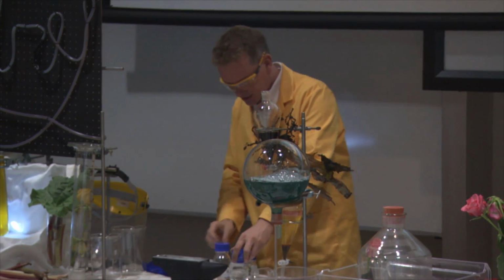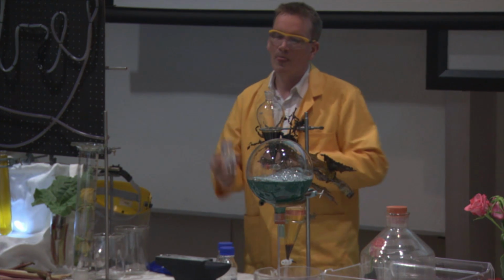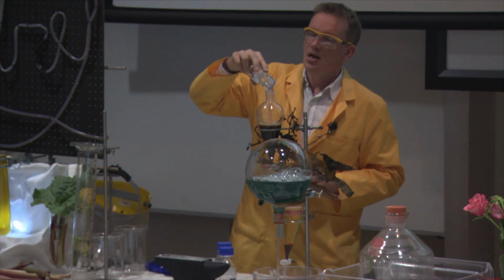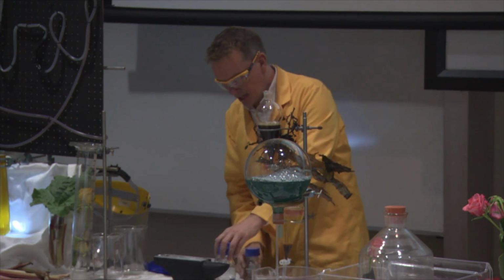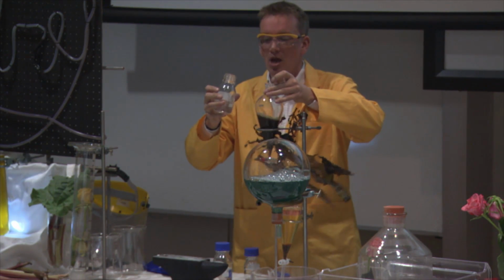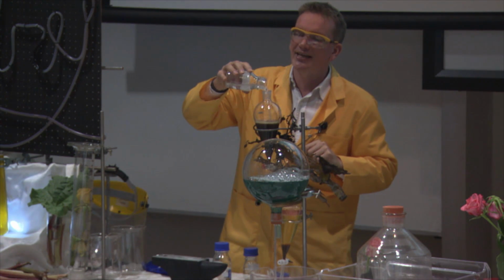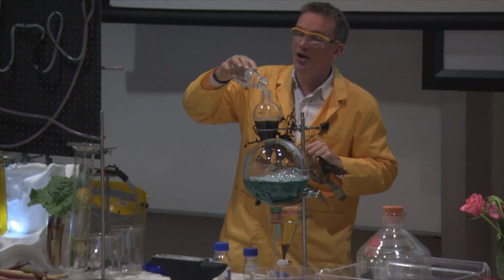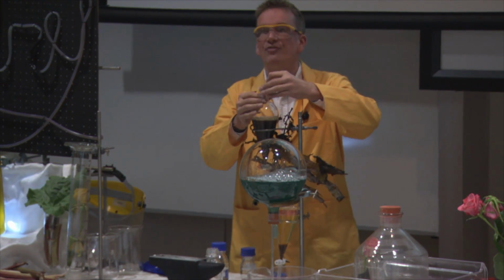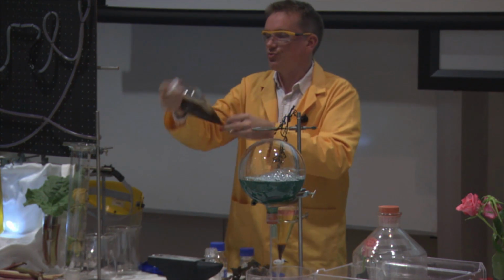I'm going to add some acid to this. Okay, so add some acid. Now I'm going to add something else, some hydrogen peroxide. Now this is used to convert any of what I'm looking for, which is, I'm trying to find some iodine. But in the seaweed, it's not there as iodine, it's as a negatively charged ion, iodide. And the hydrogen peroxide here releases the iodine. Oops, my seaweed's falling out. So just give this a bit of a swirl.